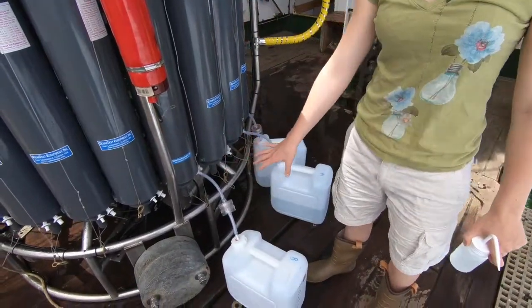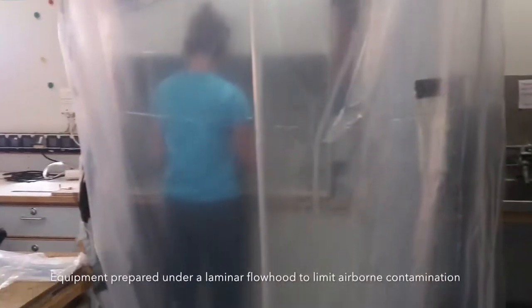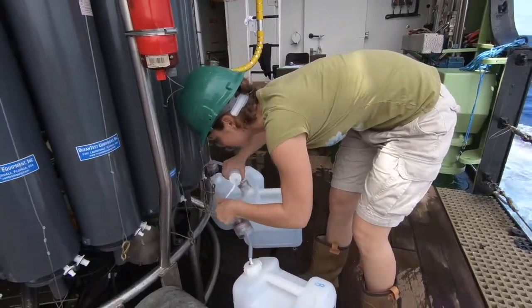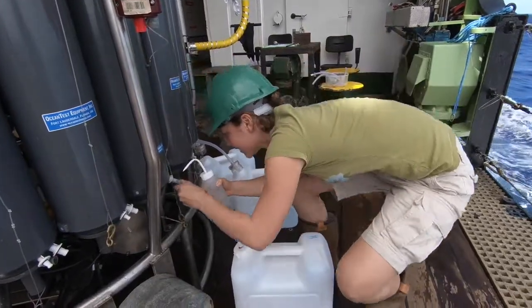All of this was prepared in clean conditions on the laminar flow to prevent any airborne fibres getting in, so that we're sure that the microplastics we're sampling are actually from the sea and not from our clothes and what's all around us.